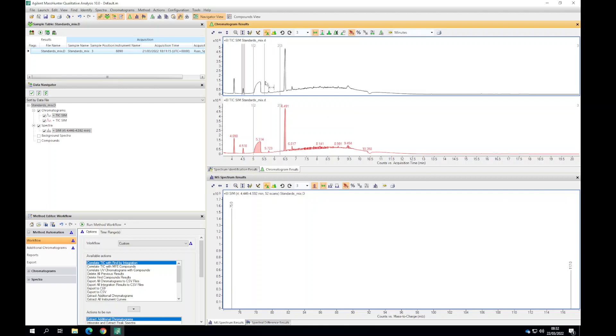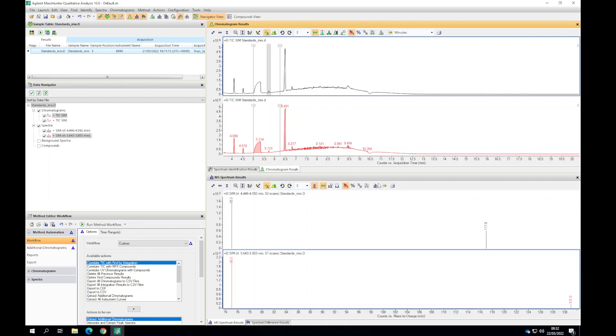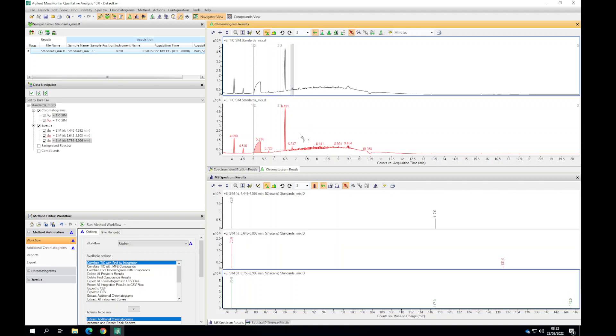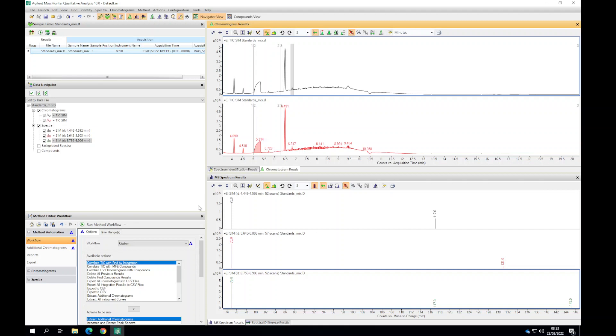We're also doing this for propionic acid, the one we worked with yesterday, a 131 and 75 ion, and then for butyric acid we have three different ions: a quantifier ion and two different qualifier ions. This is all information we gathered from the NIST database and by doing that full scan analysis, pulling out those extracted ion chromatograms to see where our peaks are eluting.